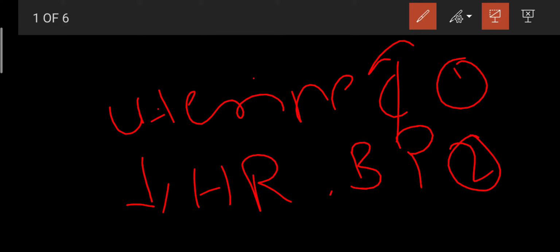Now we want to design an experiment as a scientist. B.Pharm graduates are eligible to be scientists. If you have a plan, you can conduct research that gives an idea of the presence of oxytocin in a preparation. Whatever preparation you make in your research or lab, you can make a synthetic drug whose activity is similar to oxytocin. Instead of oxytocin, you could use your drug for induction of labor or to improve the function of the mammary glands.